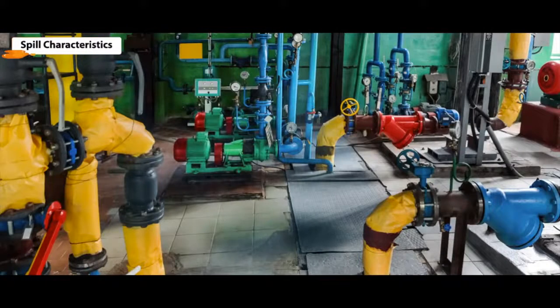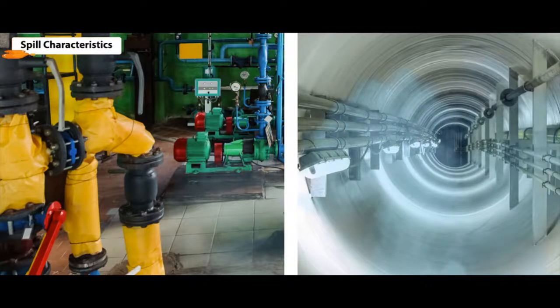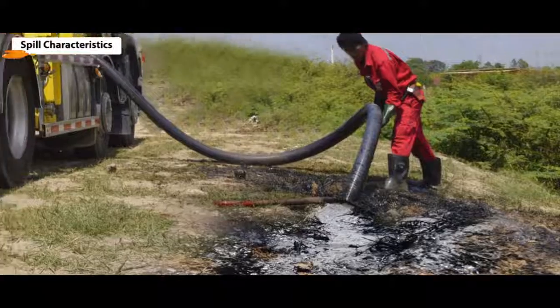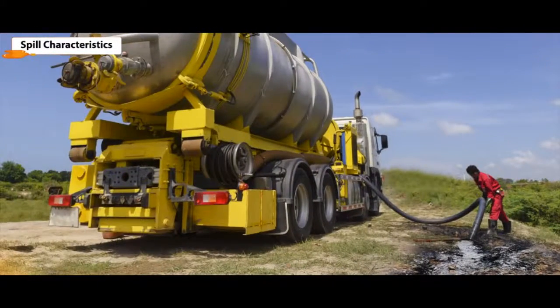The conditions in the work area also play a major role. A well-ventilated area can be less hazardous than a confined space, for example. The amount of space that material takes up can also affect spill response. If the spill is located near a drain that deposits in local water sources, or is close to a water source or soil itself, it will require a much more urgent response.